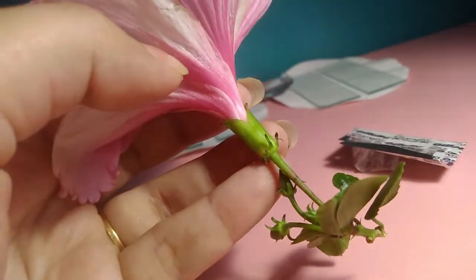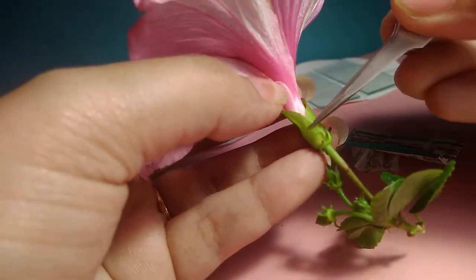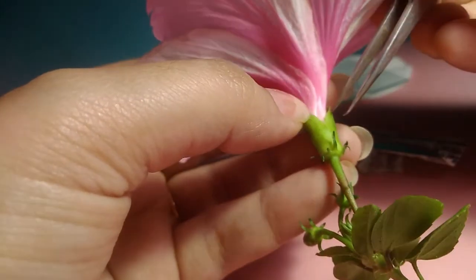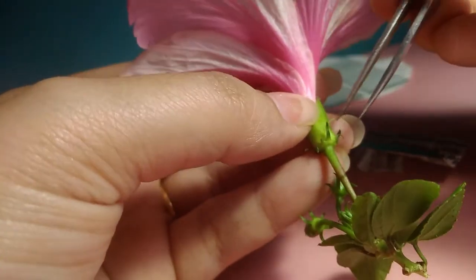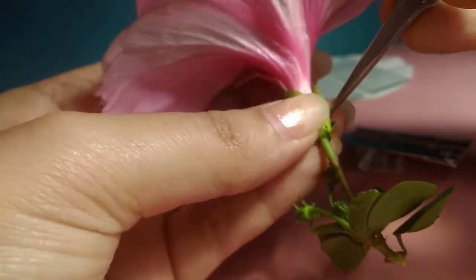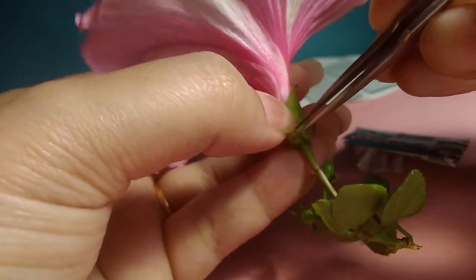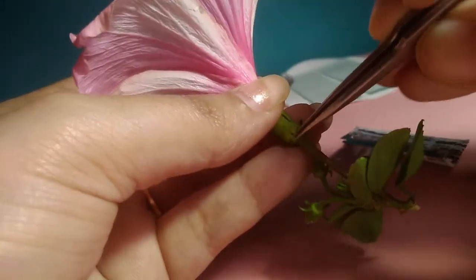Okay, so I have cut the calyx, and I will try to separate it. Be very gentle, otherwise you might break the entire flower.